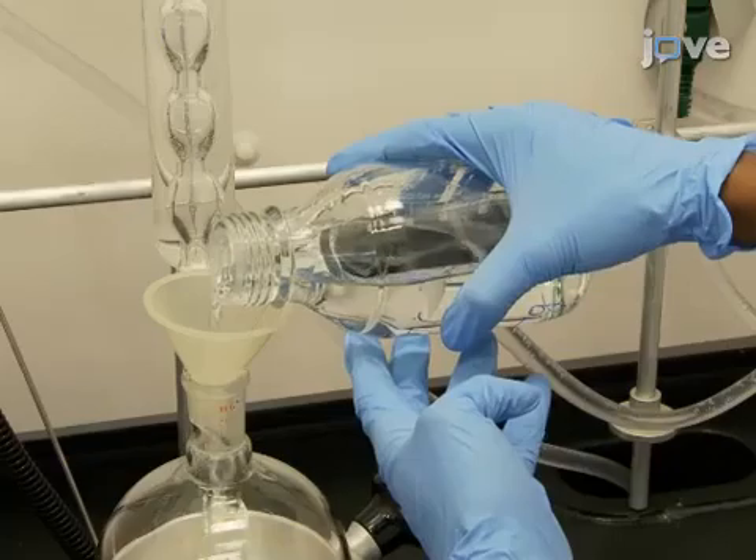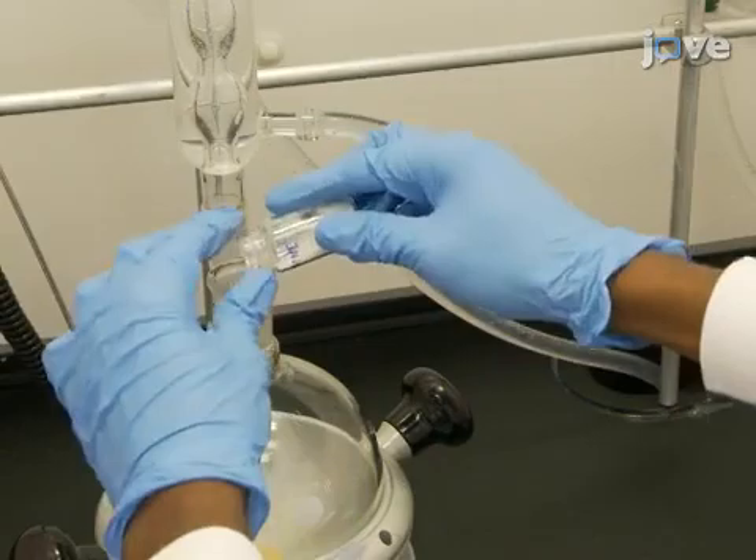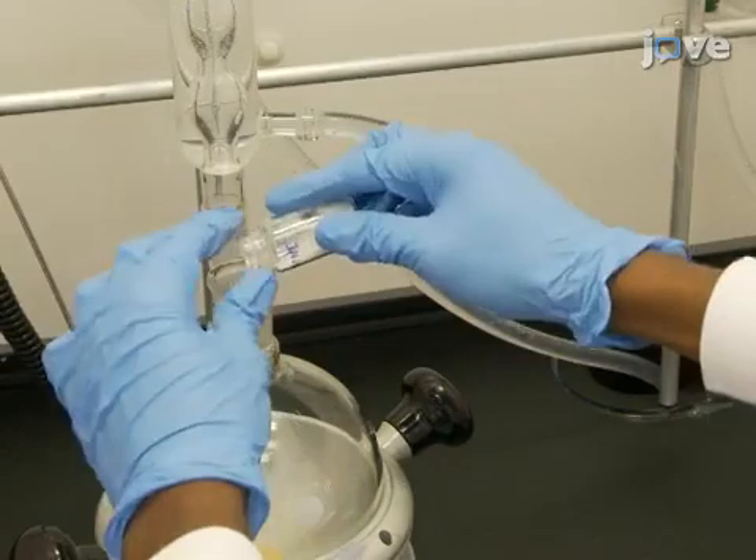Add 327 grams of acrylic acid and 4.9 grams of hydroquinone to the flask. Then use a heating block to heat the mixture to 150 degrees Celsius.